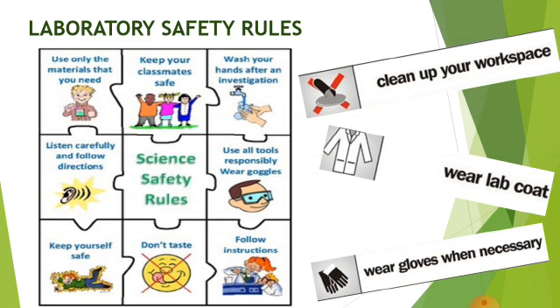Don't taste, it's very dangerous. Many chemicals might be there and some of them might be toxic. Keep yourself safe, it's very important. Don't put fingers in any switches, don't touch any unnecessary things. Listen carefully and follow the directions. Your teacher tells you again and again to listen carefully and follow the directions. So you should follow the steps.